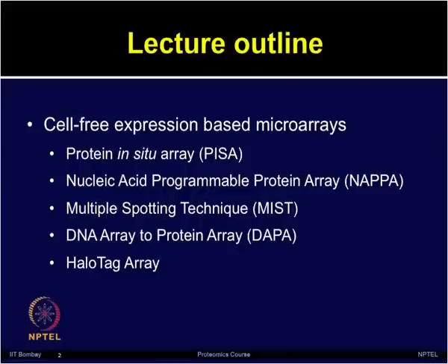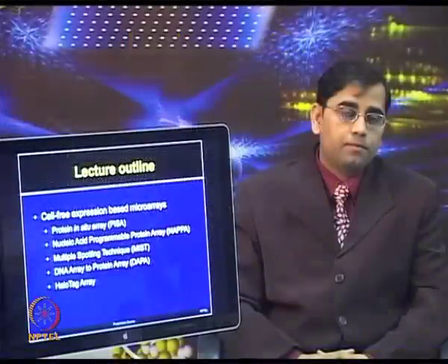We will talk about protein in situ arrays or PISA, nucleic acid programmable protein arrays also known as NAPPA, multiple spotting technique or MIST, DNA arrays to protein arrays also known as DAPA, and HaloTag arrays.